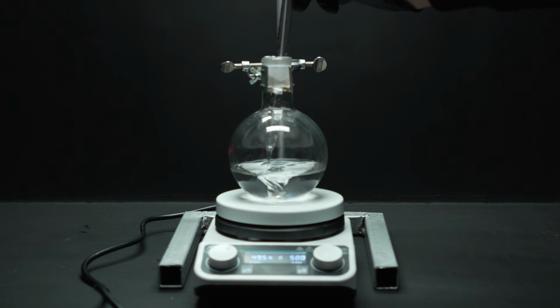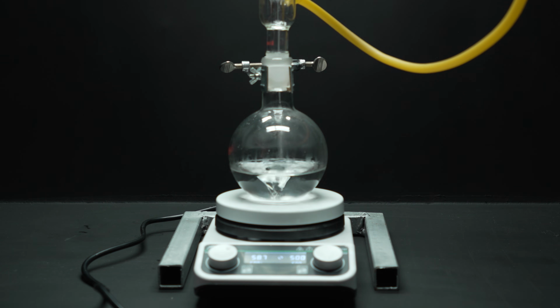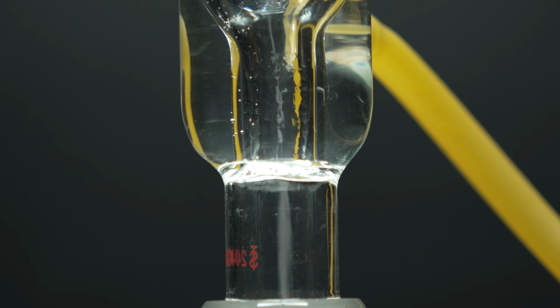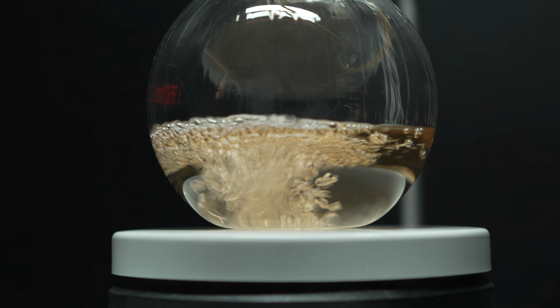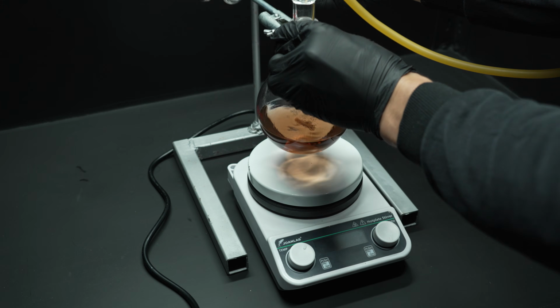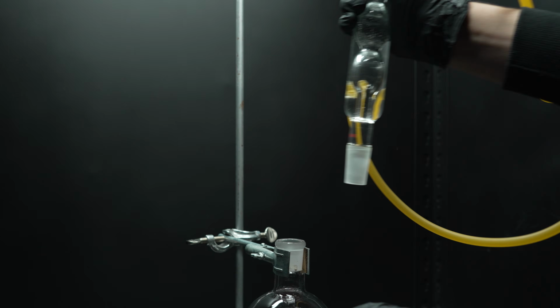This time I ran the reaction with a larger excess of acetic acid, 5 equivalents. To drive the equilibrium toward the product, I mixed the reagents and refluxed the mixture for 3 hours. This time everything definitely went differently. The reaction changed color, and I was really happy to see that.